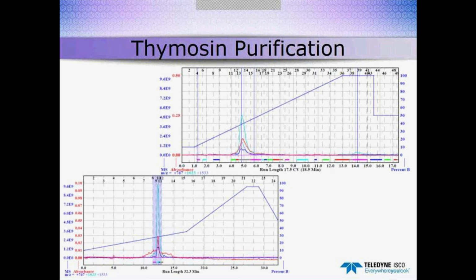For some applications, that's sufficient for us to be able to move on to whatever the next step in the process would be. So you can see the difference right away between a lower resolution Flash C18 column versus a high performance preparative HPLC column.